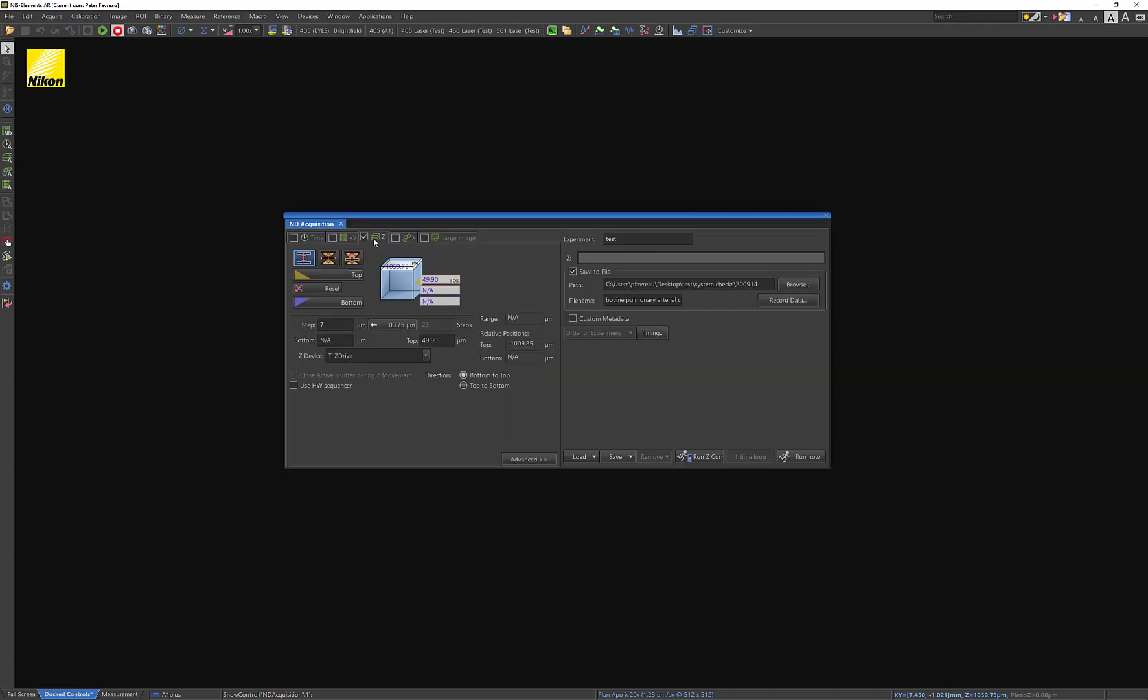Let's talk a little bit about what we're seeing here. So we've navigated here, and there's essentially three ways of acquiring a Z-Stack. The most common is the one you see right here, which is defined by the top and bottom. And that is where you are going to go into live mode, and you're going to say this is the top and this is the bottom.